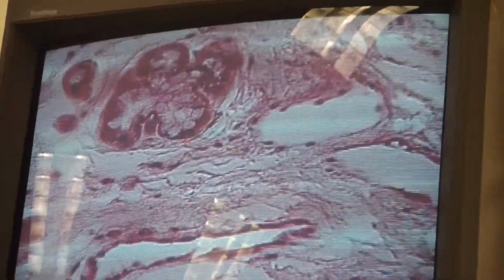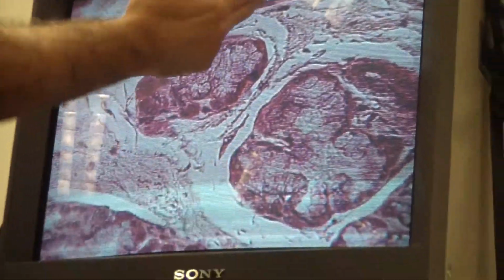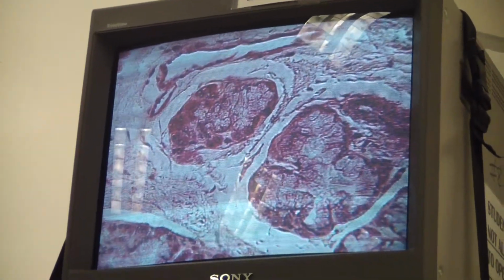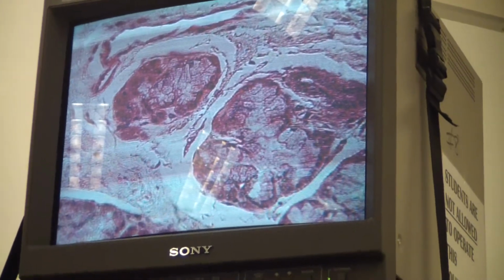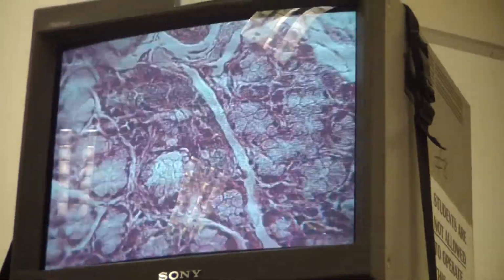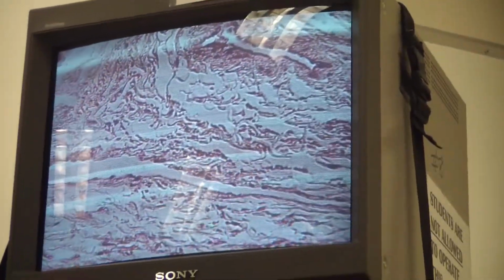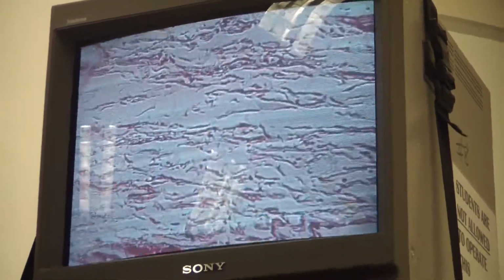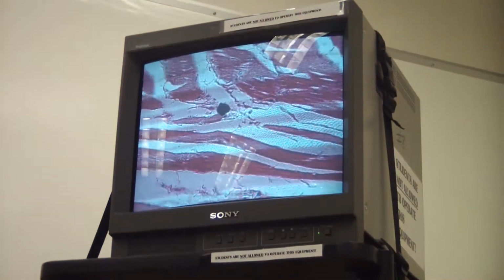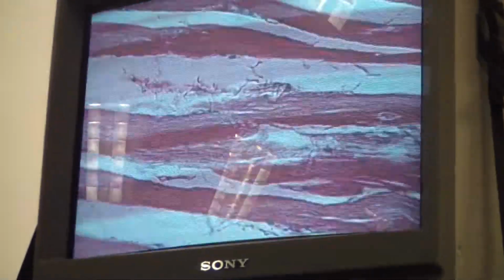Of course, that's the muscularis mucosa. The submucosa. So you've got a vein, right? That's the vein right here. Because remember, the veins are larger and collapsed. What did we say we find in submucosa? Arteries, veins, lymphatic vessels, nerves, mucous glands. And of course, this is too large. I mean, you don't want to do that. But again, these are all collagen fibers, dense, irregular connective tissue. And then you get to muscularis externa with circular and longitudinal.